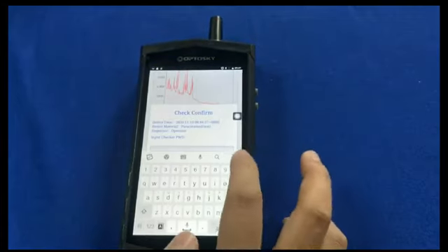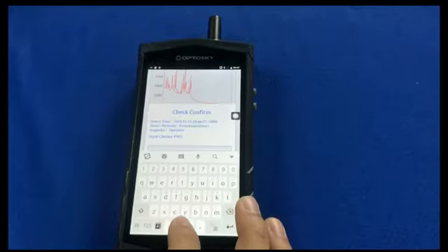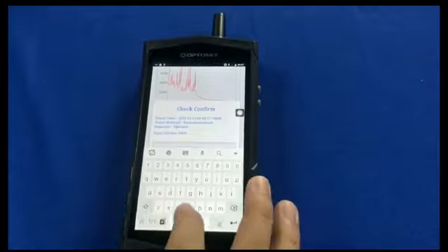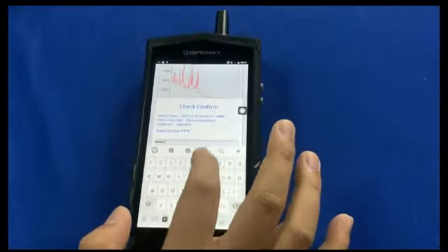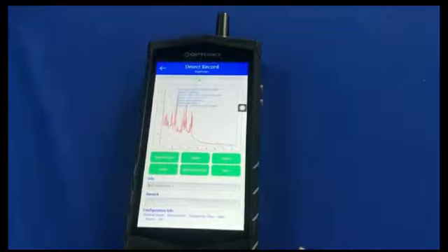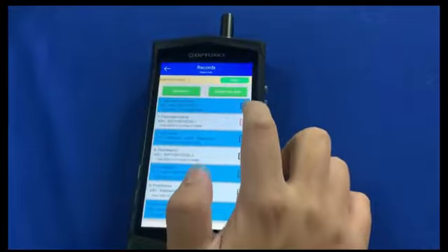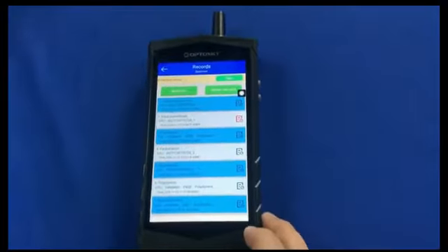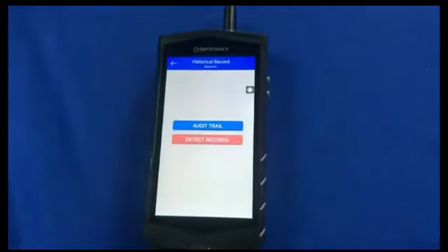And further, let's move to test A. Test A is to create a new library and scan a historical test. First of all, you need to log in as a supervisor, and in the role of the supervisor, you can create. Let's log in to the spectra.